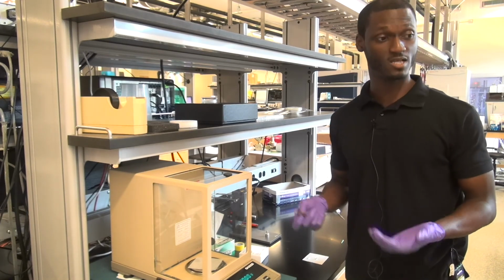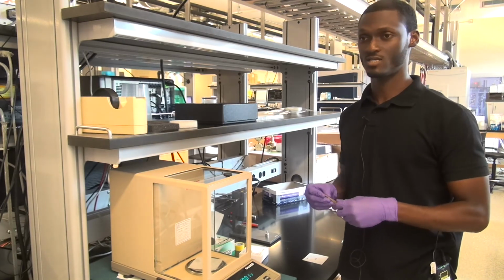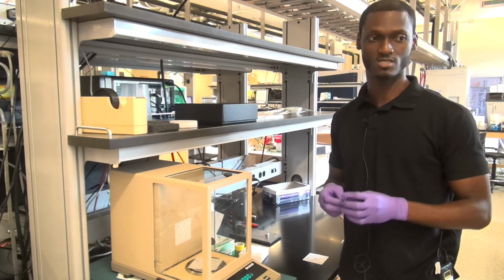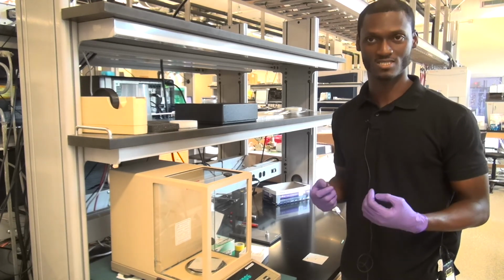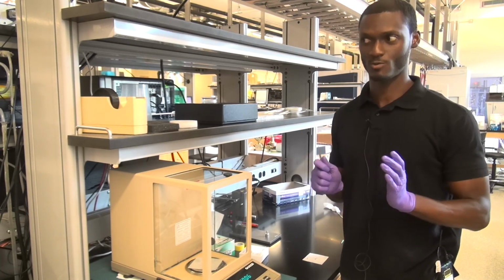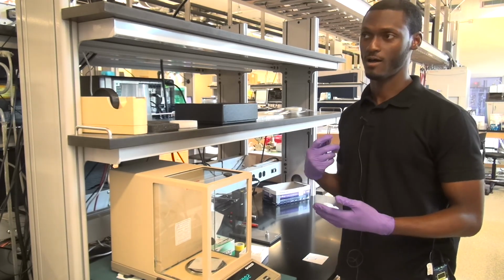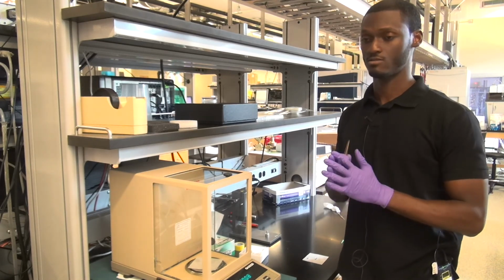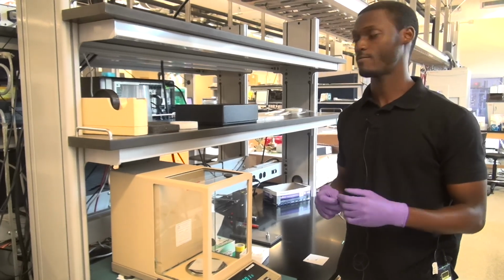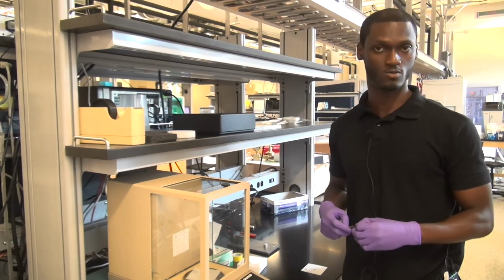If you're unsure about the stability of your material, I always suggest running the TGA first. And when I say the stability of your material, I mean your physical material. A lot of people come in with publications saying that their material is stable, but they've never tested the material that they made. So there's always going to be differences between what the publications say and what you make. So always make sure you do those first. Better to be safe than sorry. You would run a TGA and make sure that everything is safe within the temperature range that you care about. Then you can run your DSC. Okay? So always be sure to be safe and understand what your material is going to do before you go in and do the experiment.